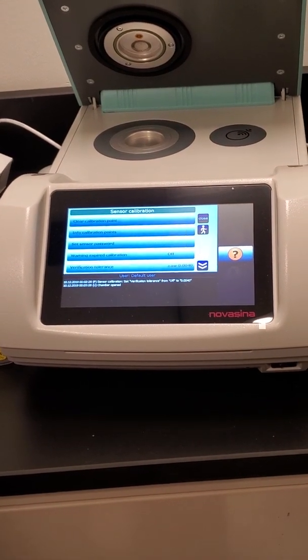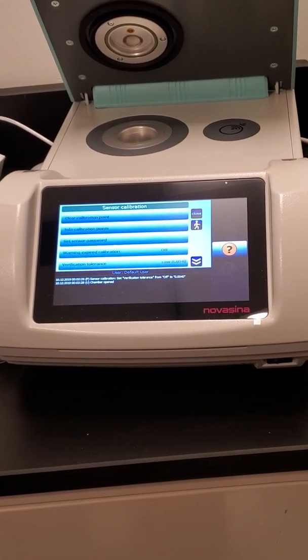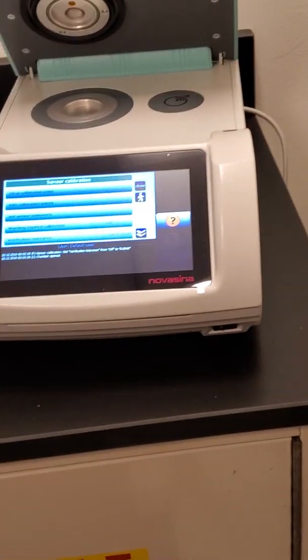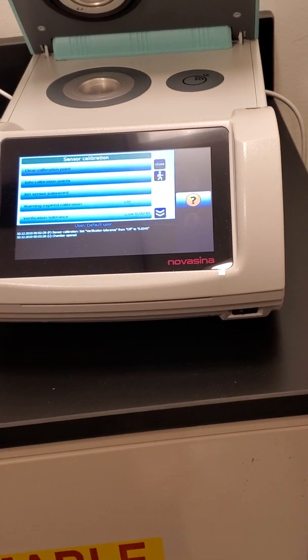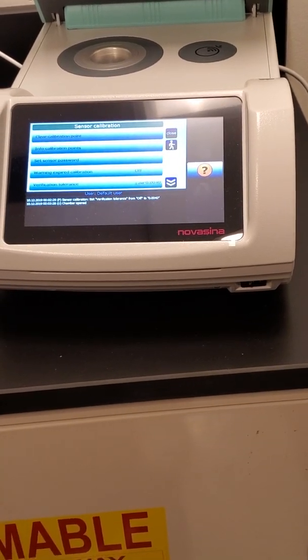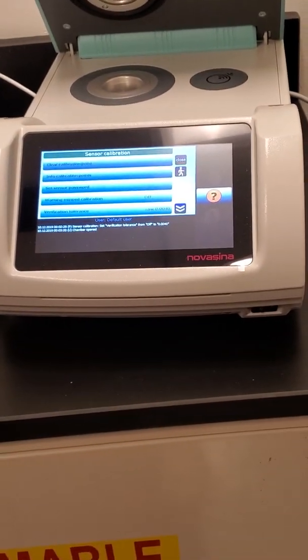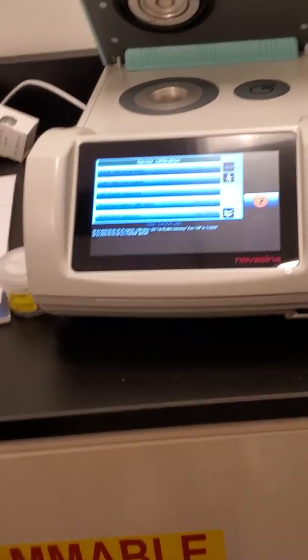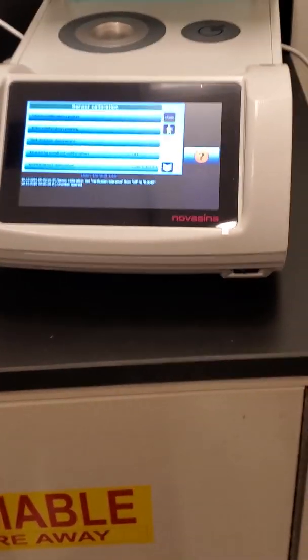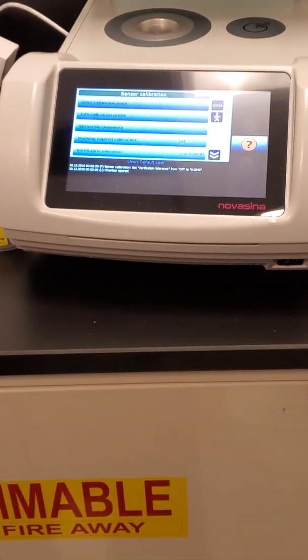And for recording purposes, how long do the standards last? They should be good for up to 3 years, as long as you take care of them. The main thing is not to leave them out like I am with this one right now, because I took it out of here. But it should go back in here and get sealed up. As long as you keep them in these plastic containers and shut them tight, they should be good. The reason why you don't want to leave them out is because they'll change to match room humidity. I see. Would it be better if you put it in like a desiccator? No, that'll dry them out. A sealed container is what this is. Yep. And that's good, just at room temperature. You don't have to put it in a refrigerator. No, nothing like that. Keep them at room temperature.